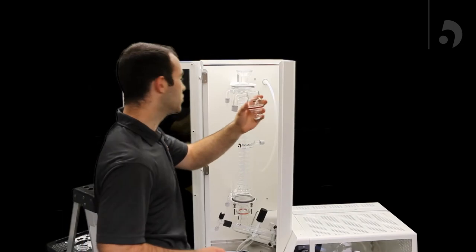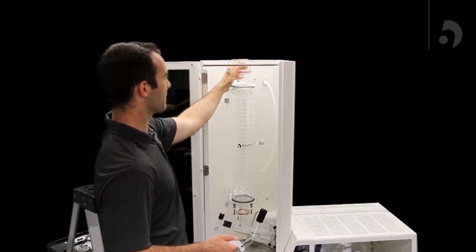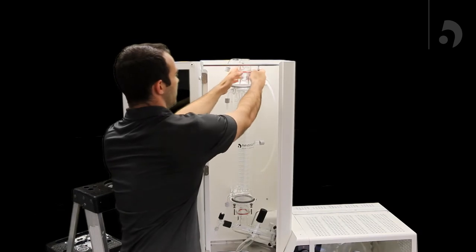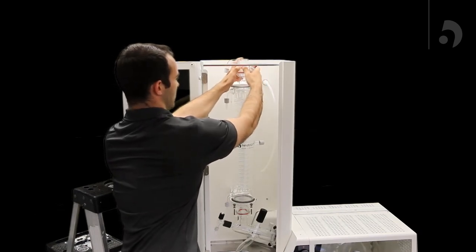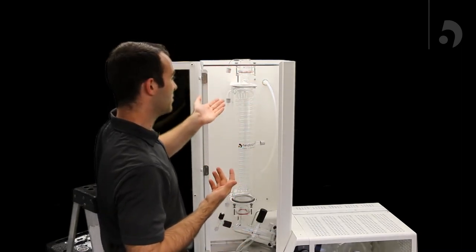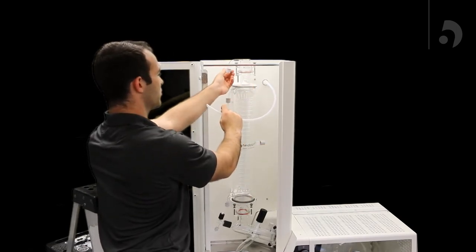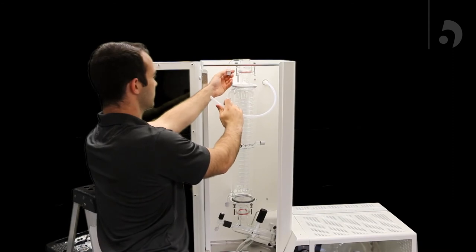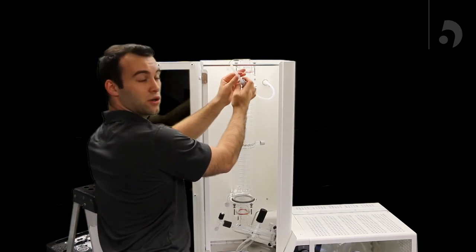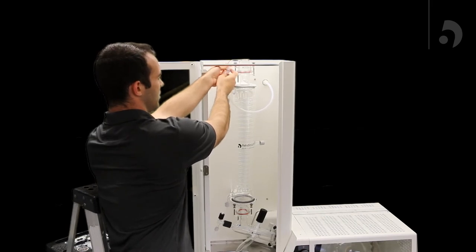Now we're going to add the vacuum fitting to the condenser. You're first going to place it on the very top, take a C-clamp, fit it around the back and slide it up. Now we're going to add the vacuum tubing to the vacuum fitting which comes straight out of the housing. Unscrew the cap, slide the tubing through it, making sure you get the ferrule over as well, and then slide it in and screw it back up.